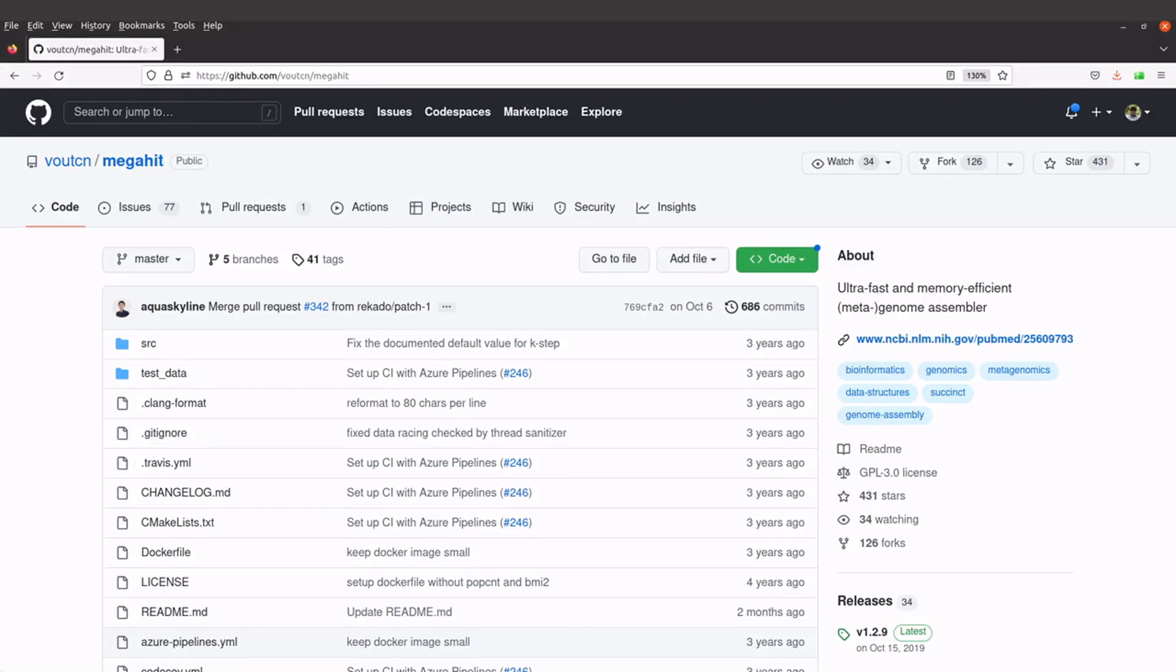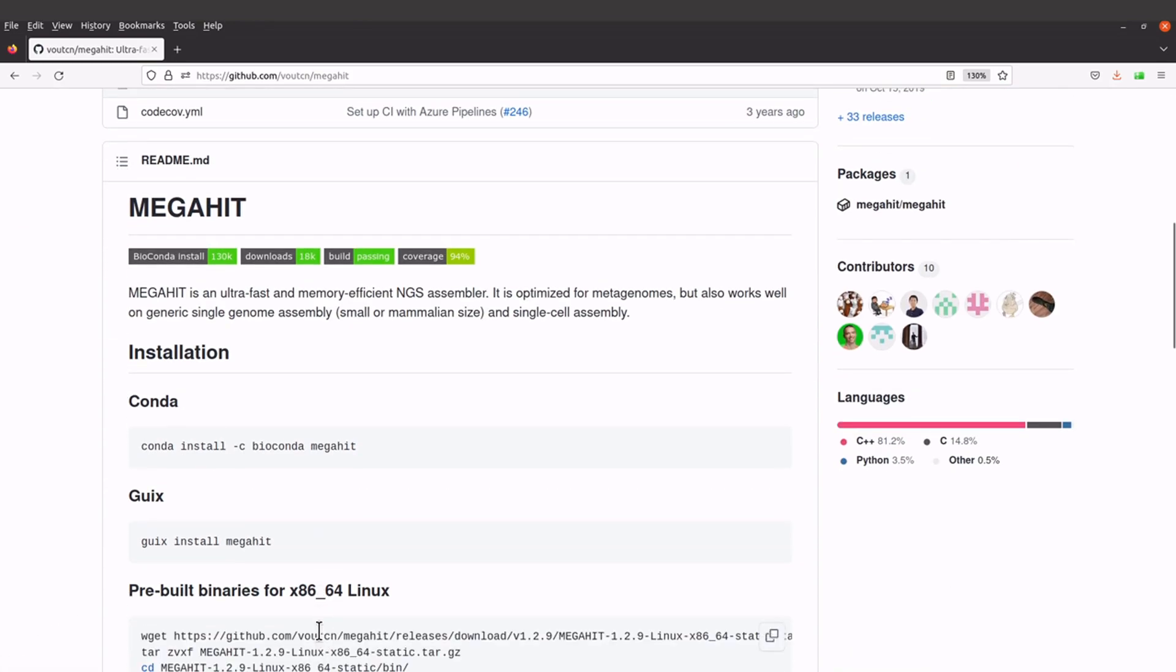In this tutorial I'm going to show you how you can install MEGAHIT on a Linux or MacOS system. MEGAHIT is a genome assembly tool.